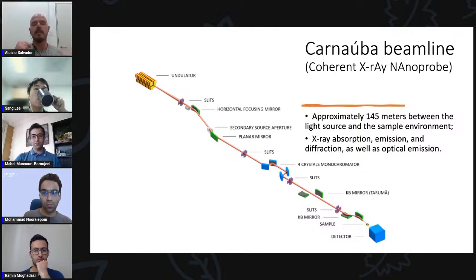Just for contextualization, microfluidic devices are known to operate with small amounts of sample and channels that can vary from micrometers to submicrometers. Also, microfluidic devices have small size and low weight but high throughput, and that's why they have drawn a lot of attention from the synchrotron community to perform in situ or in vivo experiments in the beamlines.